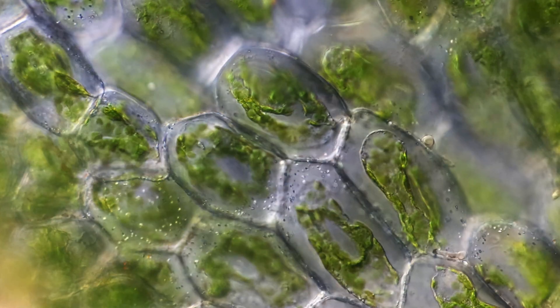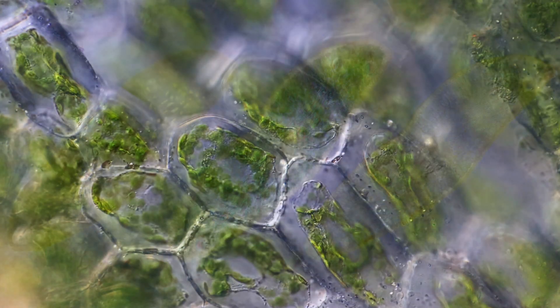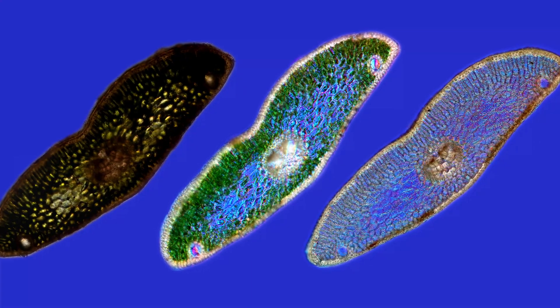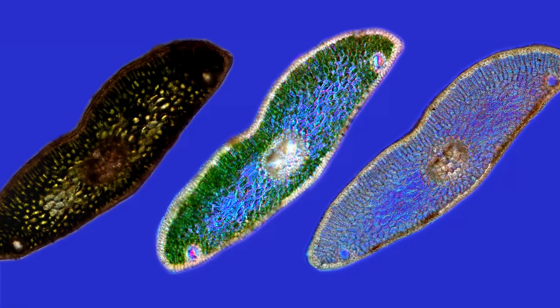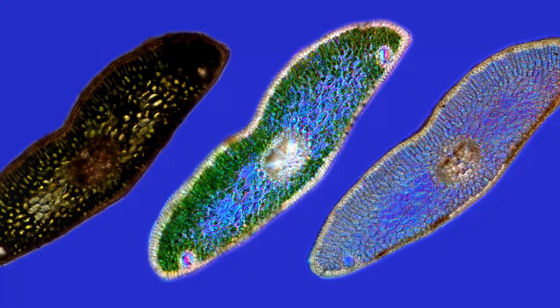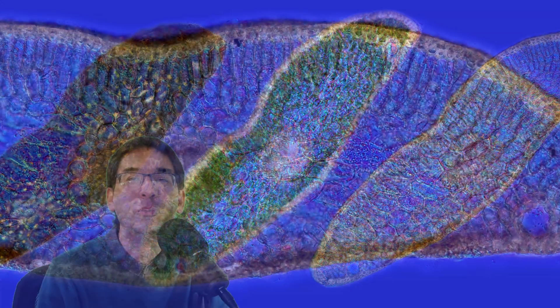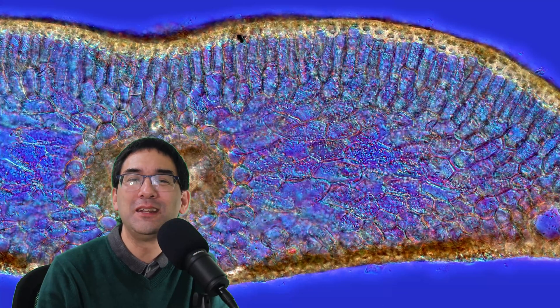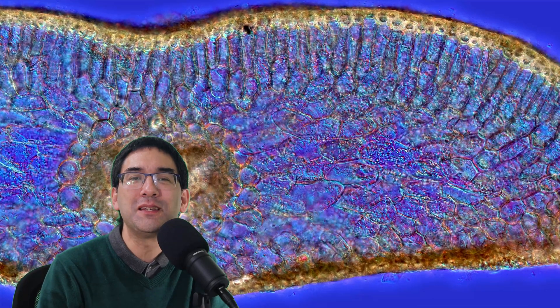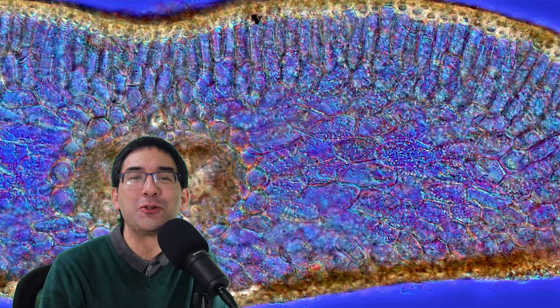Now let's try a direct image comparison. On the left is the original section — pretty dark and not very transparent. In the middle is the one treated with sugar solution only. On the right is the one treated with alcohol to remove chlorophyll and then sugar for further clearing. I personally like the sugar-solution-only one the most. By trying out different approaches and doing a little experimentation, you can improve the image quality quite a bit. I think you now also have a project for the Christmas holidays!